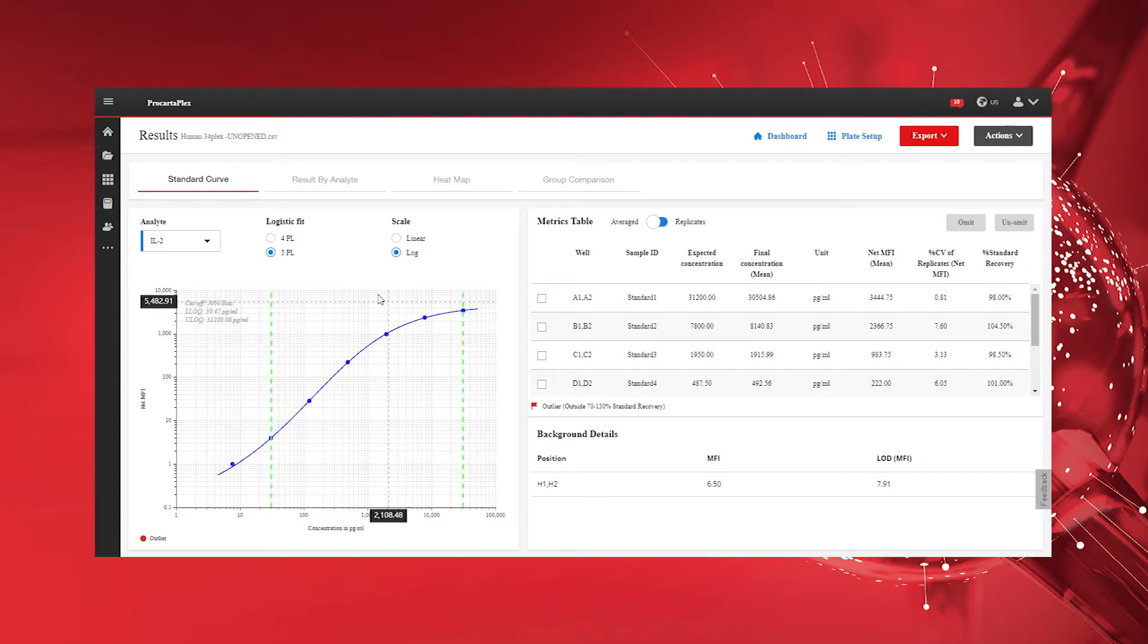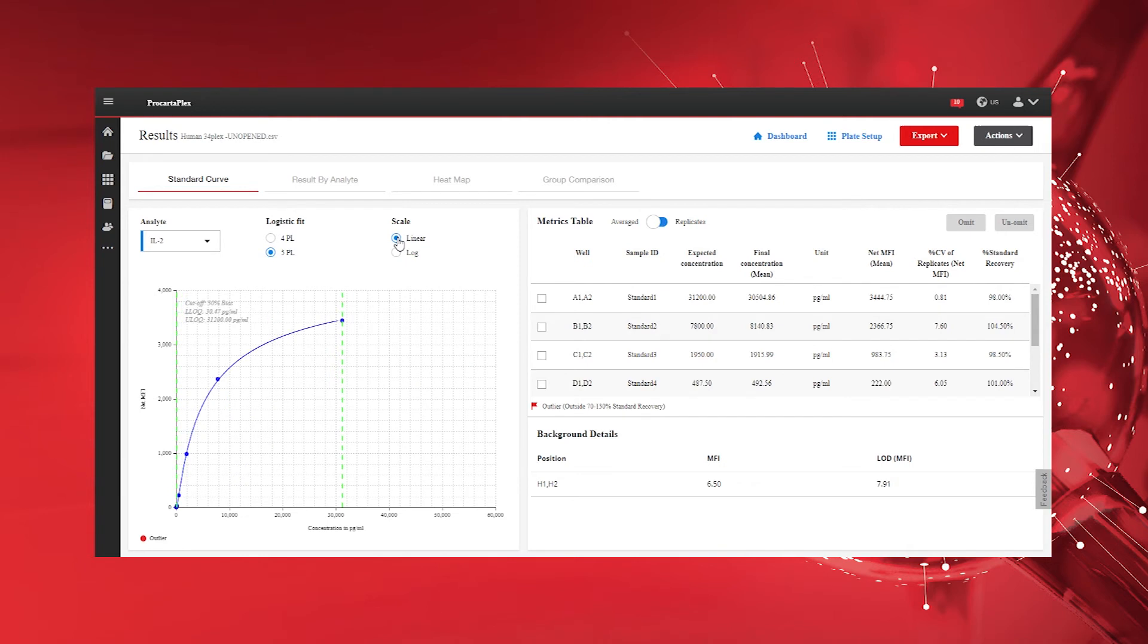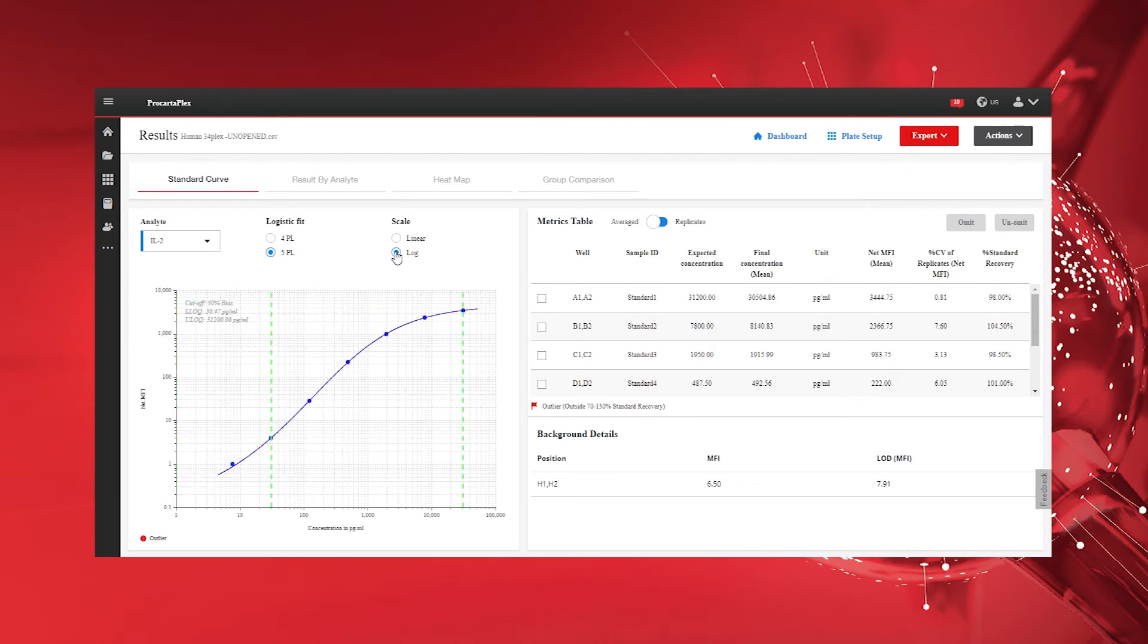Select 4 or 5 parameter logistic regression and linear or logarithmic scale according to your preference. For most assays, the recommended setting is 5PL and log scale.